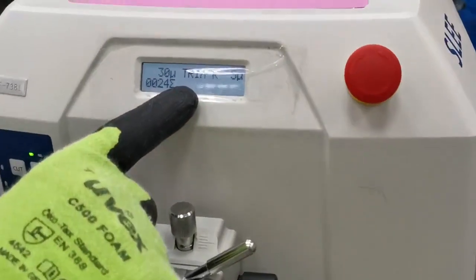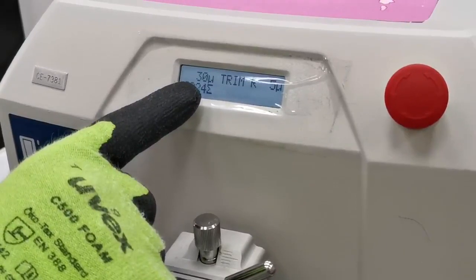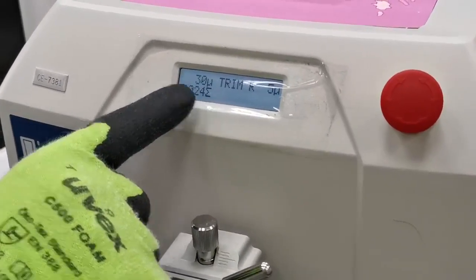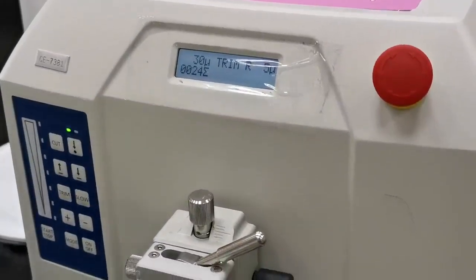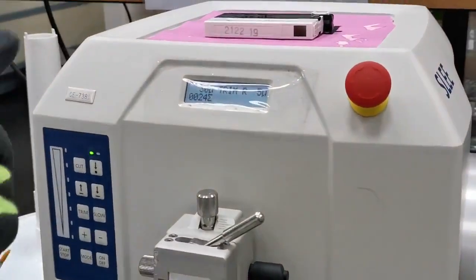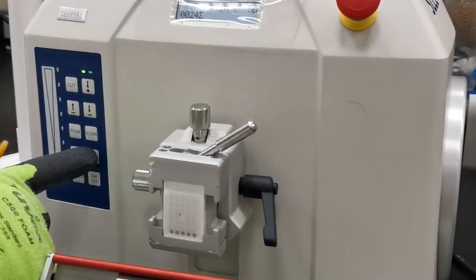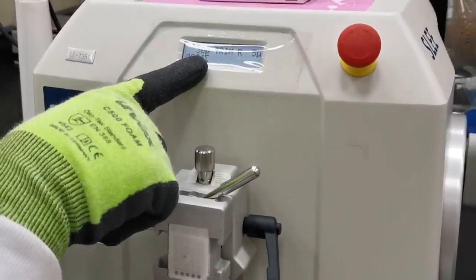There is also a trimming mode button. Once you press it, the screen changes from cut to trim, and the thickness changes from five or six micrometers to 30 micrometers, which gives thicker sections. Slow mode will slow the cutting, and you can also increase or decrease the section thickness using these controls.